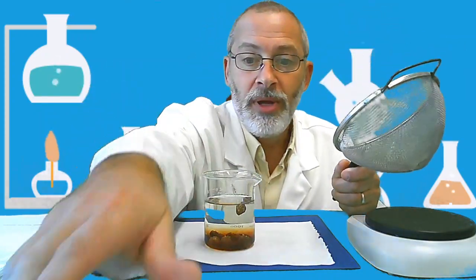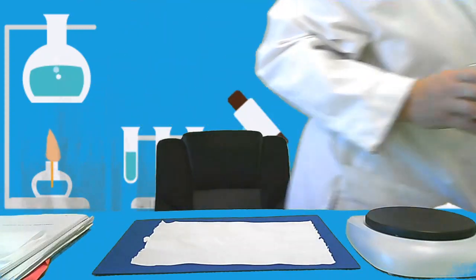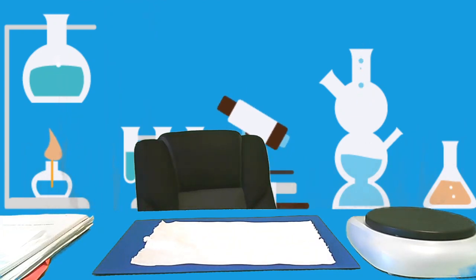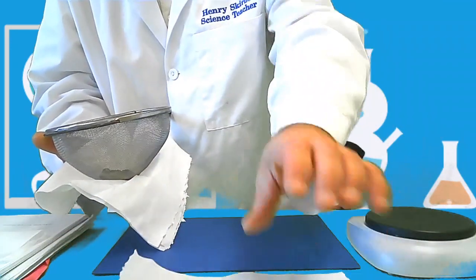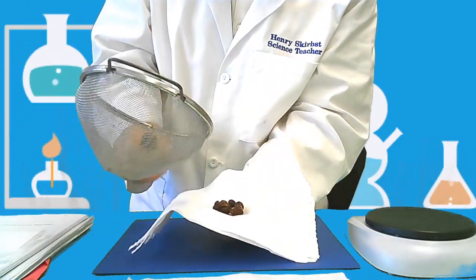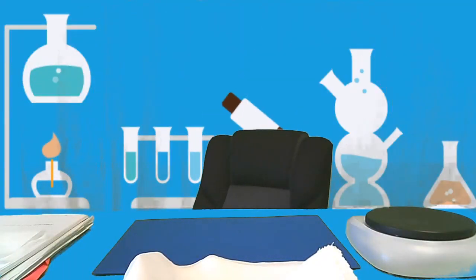So give me a moment. I'm just going to go over to the sink here and drain off our water. All right, here we go. I've drained the water off from our raisins. And let me just put this off to the side. Be right back.